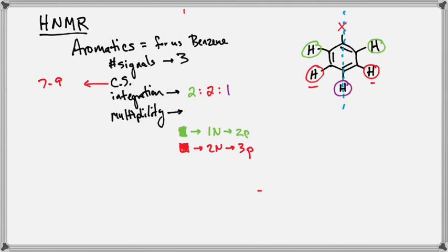Maybe Andrew just got it. What'd you get? Splitting of splitting as a potential. Okay? And that's where, oh God, I hope that doesn't happen. No, it actually doesn't. It's very rare to pick that up on the instrument. So we would just see 3 peaks, because the magnet inside the machine isn't able to differentiate those two.